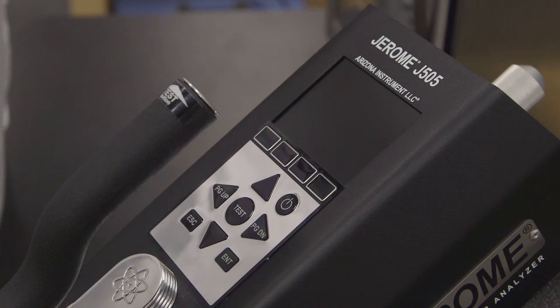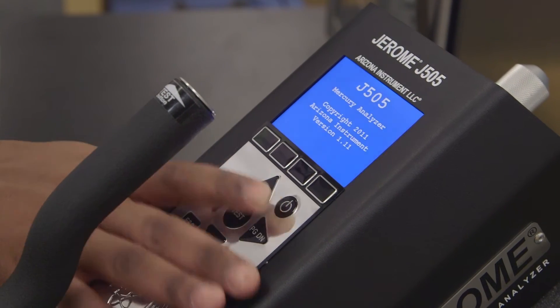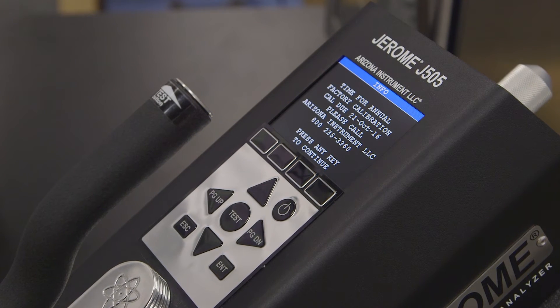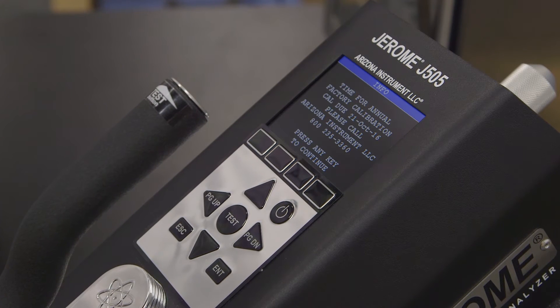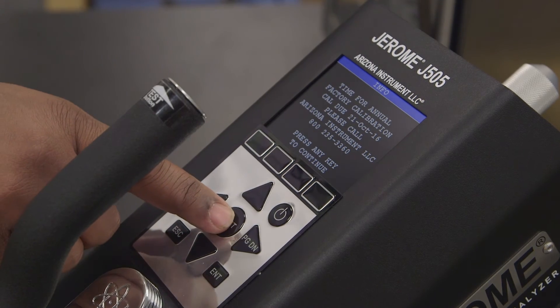To power up your new Jerome, press the power key in the upper right hand corner of the instrument's keypad. The startup screen will appear, showing the current software revision. If you're a seasoned Jerome owner, a calibration notification may appear if your instrument is due for its annual calibration. If this happens, simply press any key to clear the reminder.